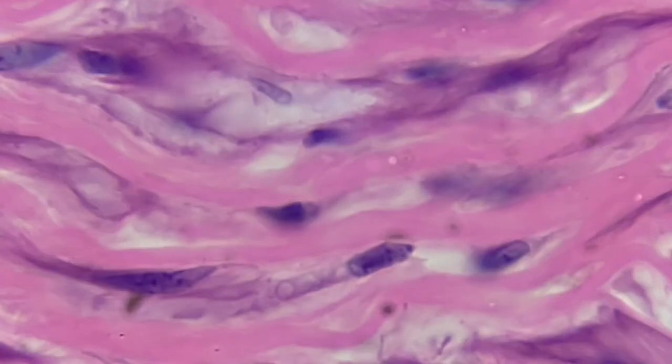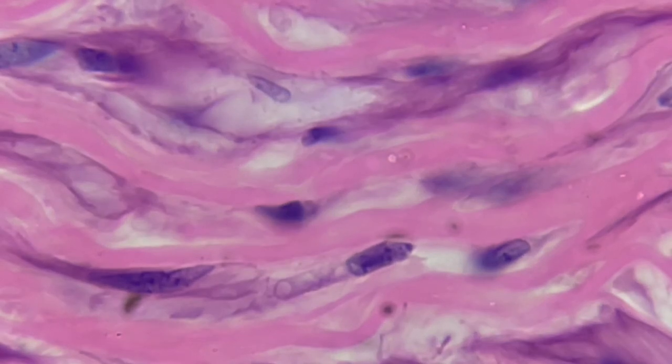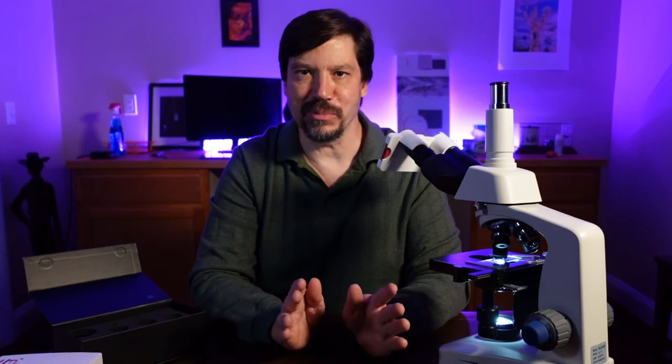Now we'll go up to the 40x — and there we can see really very nice detail. Now let's take a look under the oil immersion. Under oil immersion it's just fantastic. The quality of the image, as I can see, is just amazing — such great detail, such great contrast. So I really think this is one of the truly great ways to get high quality imagery and video for a very simple procedure.